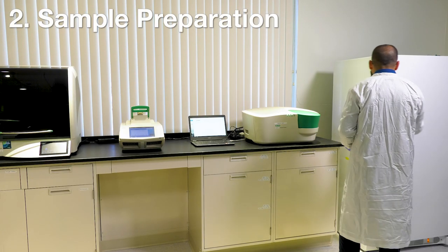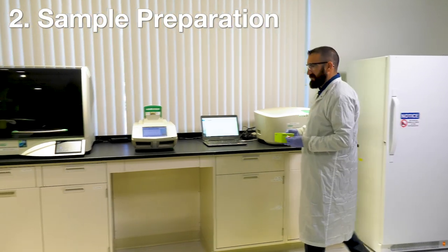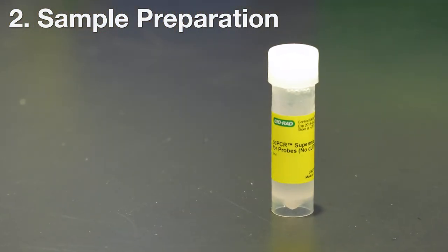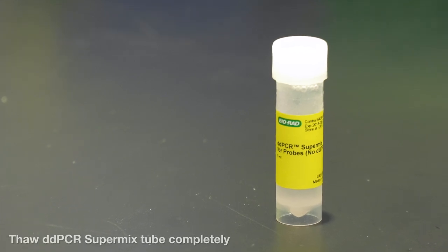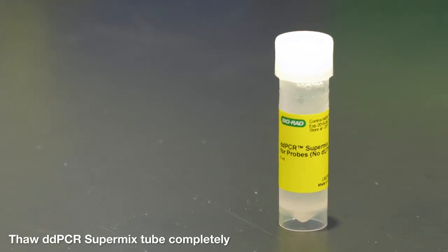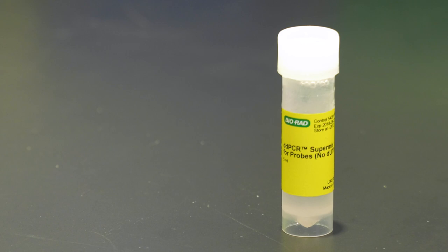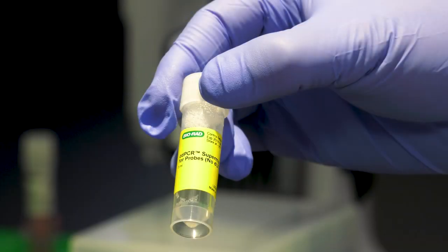To start, pull out a frozen tube of 2X DD-PCR SuperMix for probes, no dUTP, and thaw it to completion at room temperature, which will take about 10 minutes.